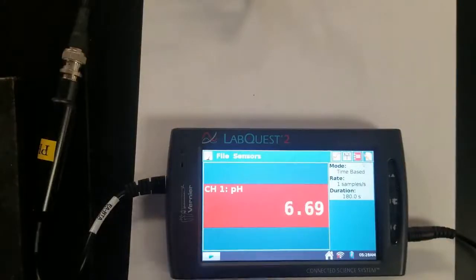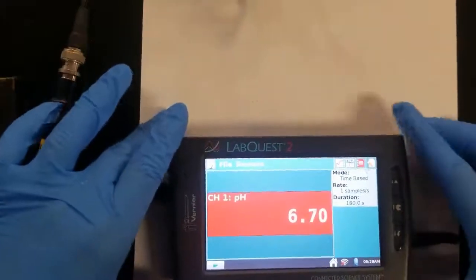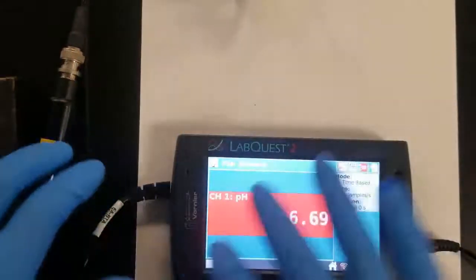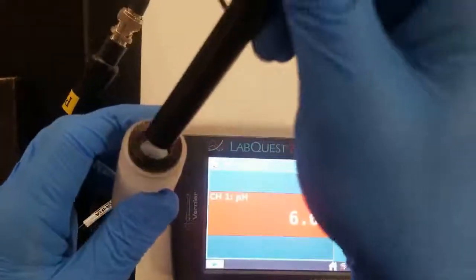All right, so we showed you the old school way to find pH using indicators. Now we'll show you the kind of new school way using instrumentation, right? This is a pH meter. So this is just a generic one that reads different stuff. And then it's attached to this pH probe. So you take this thing out of here, and you stick it into your solution. And in theory, it tells you the correct pH.